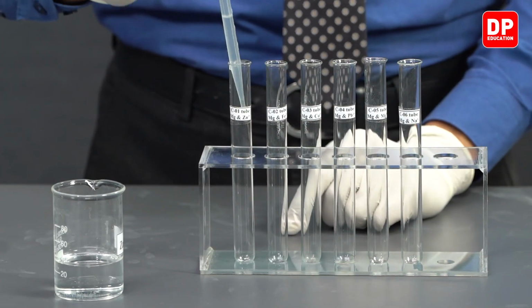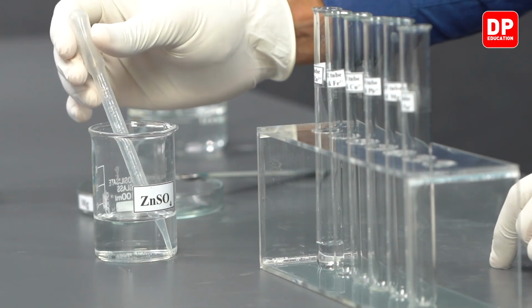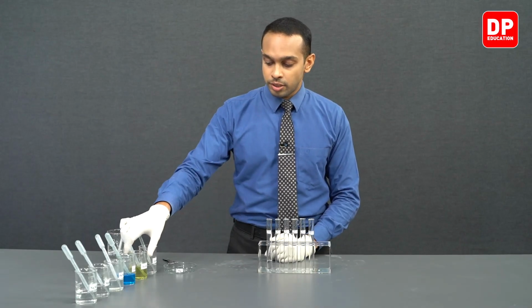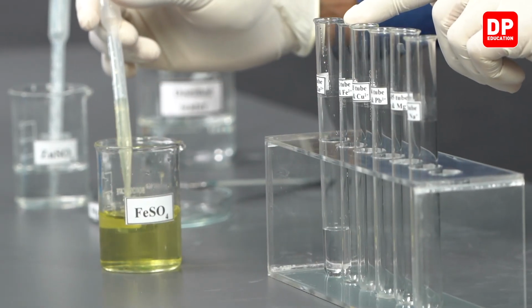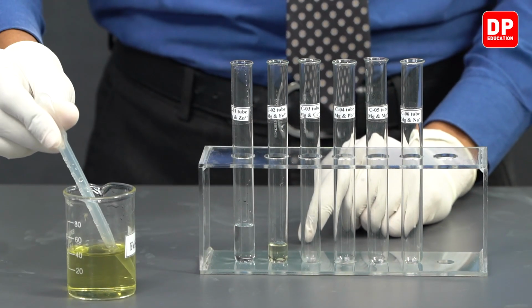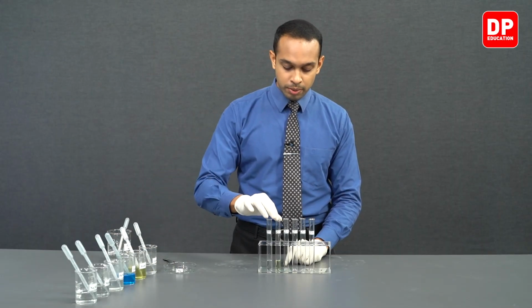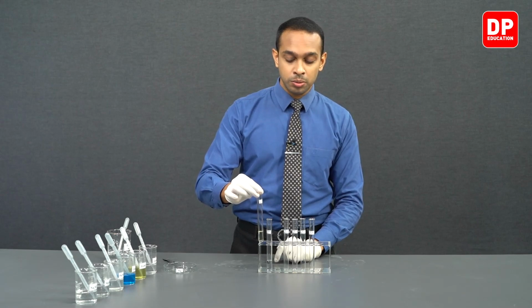There's a test tube labeled zinc 2 plus. To that we will add our zinc sulfate solution. There's another solution here, ferrous sulfate. Now we have a test tube labeled Fe2 plus, and this is a freshly prepared ferrous sulfate that we have over here. So you can observe the color of the ferrous sulfate, a pale greenish color. And after transferring about 5 milliliters of ferrous sulfate into a test tube labeled Fe2 plus, we can now move on to copper sulfate.